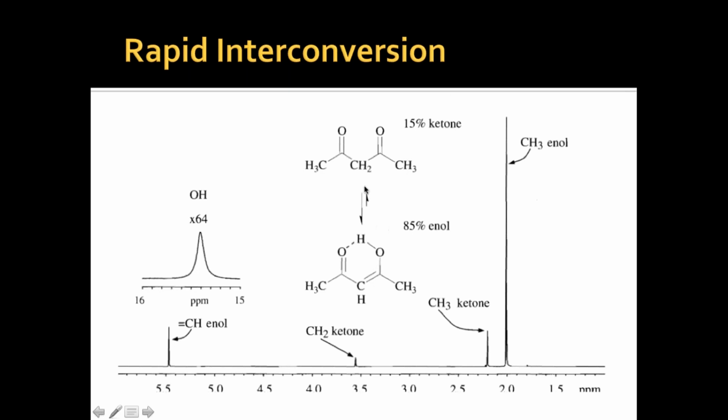The reason is very simple: electronegativity. See, this carbonyl has electronegative character and attracts the hydrogen, so we can say they are present in the enol form. That hydrogen under the electronegative influence, with hydrogen bonding, is more stable. Why? Now let's see this example.